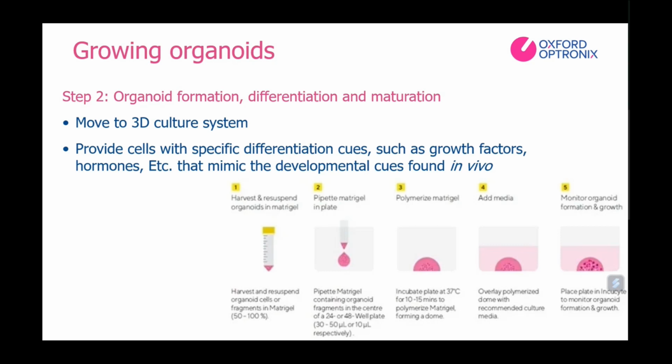After cell expansion, the cells are then transferred to a three-dimensional culture system that promotes their self-organization and differentiation into organoid structures. This can be achieved using various methods, such as embedding the cells in an extracellular matrix or using a scaffold-based system. These three-dimensional culture systems provide the cells with the physical cues necessary for self-organization and tissue-like structure formation.